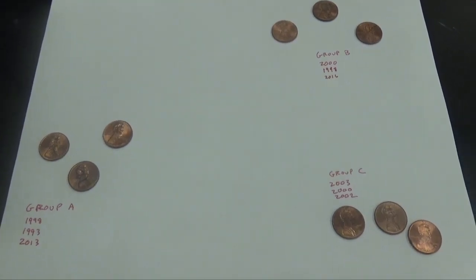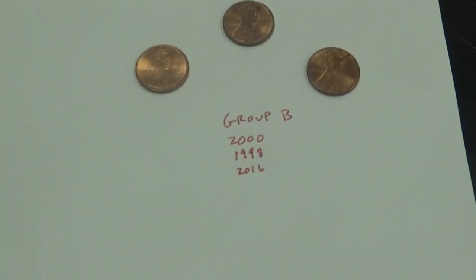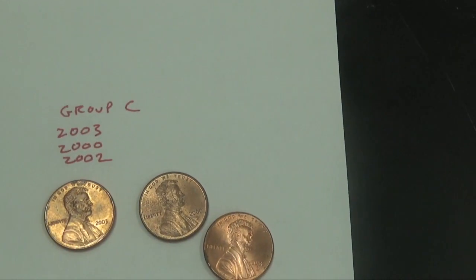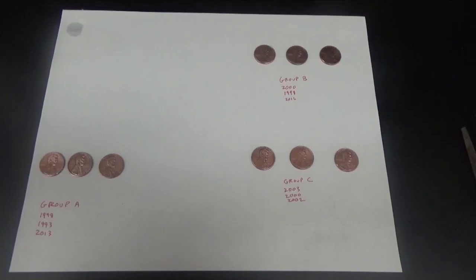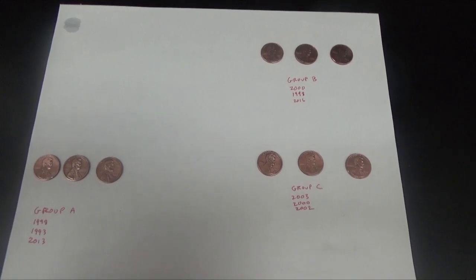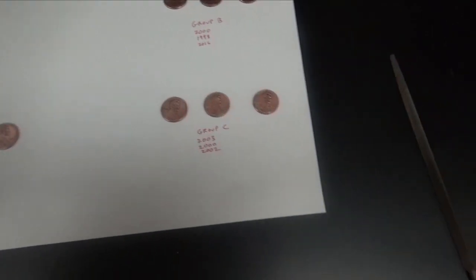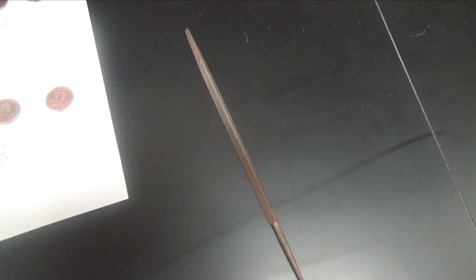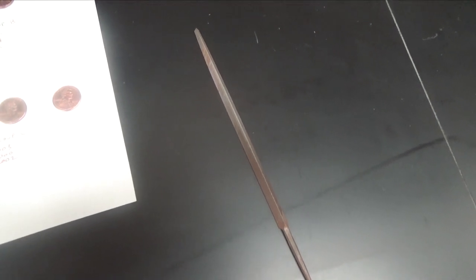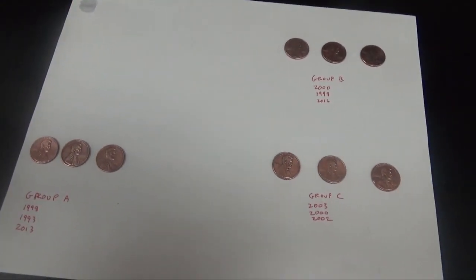The pennies are placed into three groups, and I've indicated the year in which the penny was minted from each of the groups. The next step is to clean the pennies by using steel wool. Now that the pennies have been cleaned with steel wool and then washed off with distilled water and dried, I'm now going to use this triangular file, and I'm going to use that to scratch through, make notches, and to expose the zinc under the copper of each of these pennies.